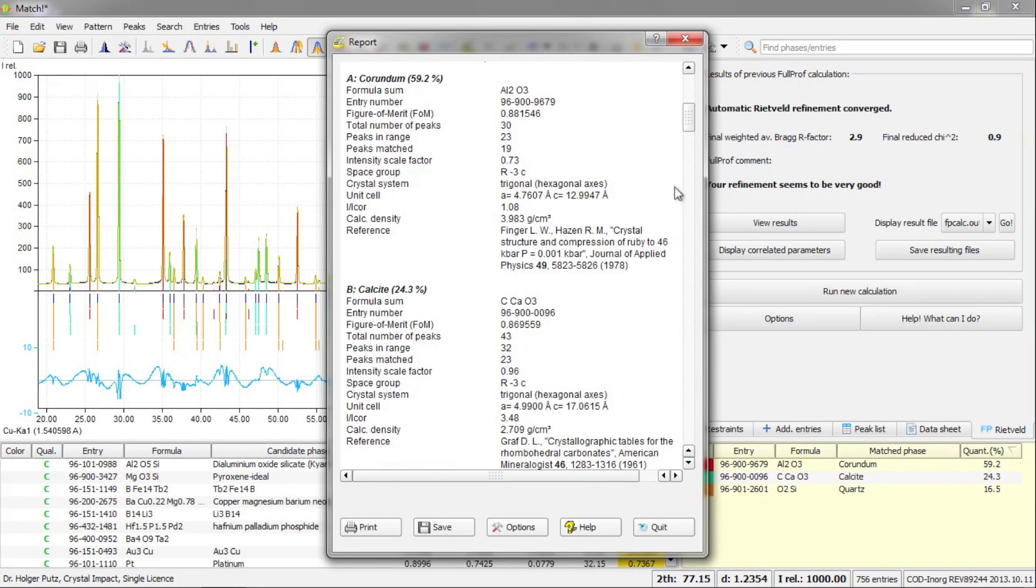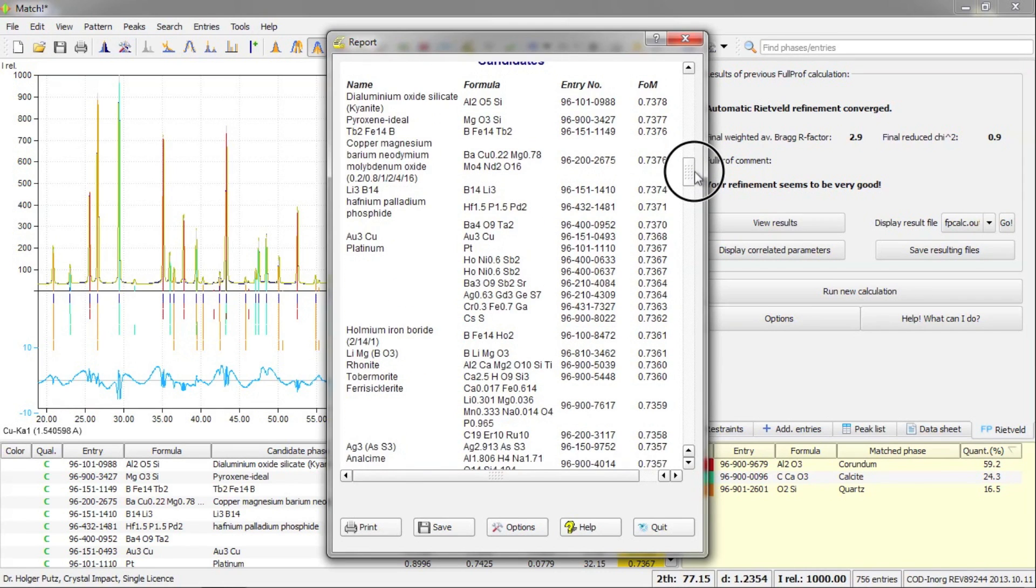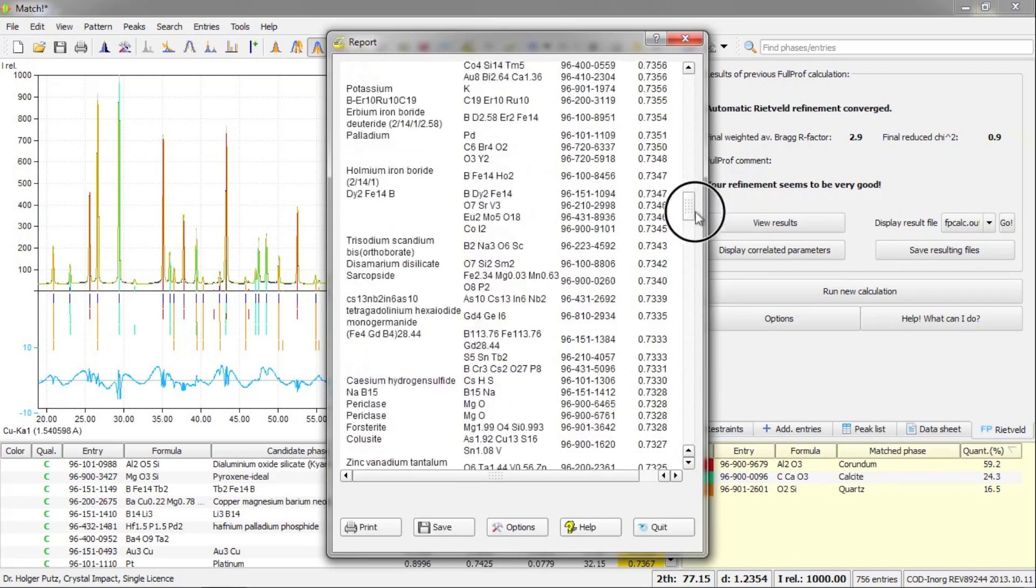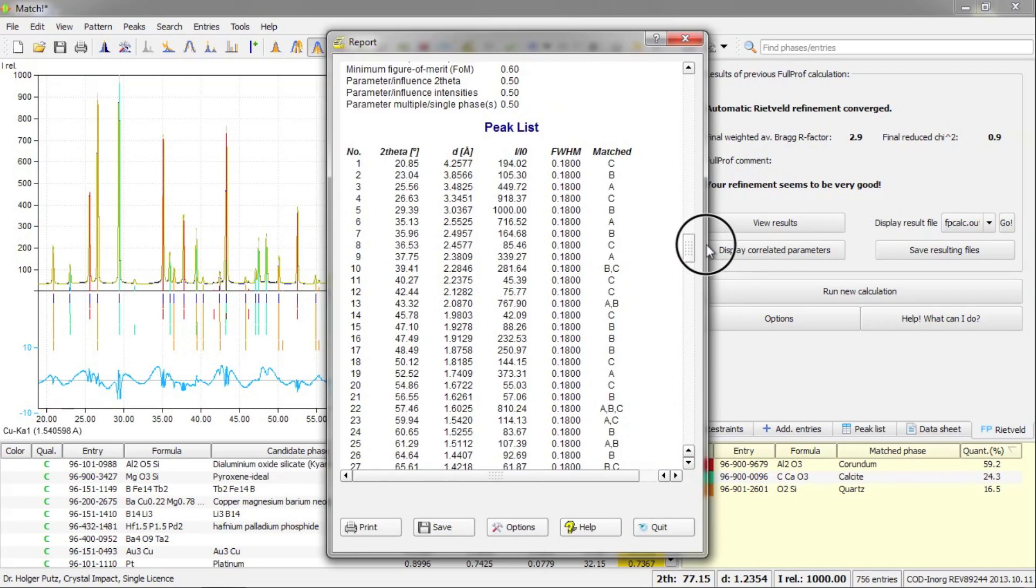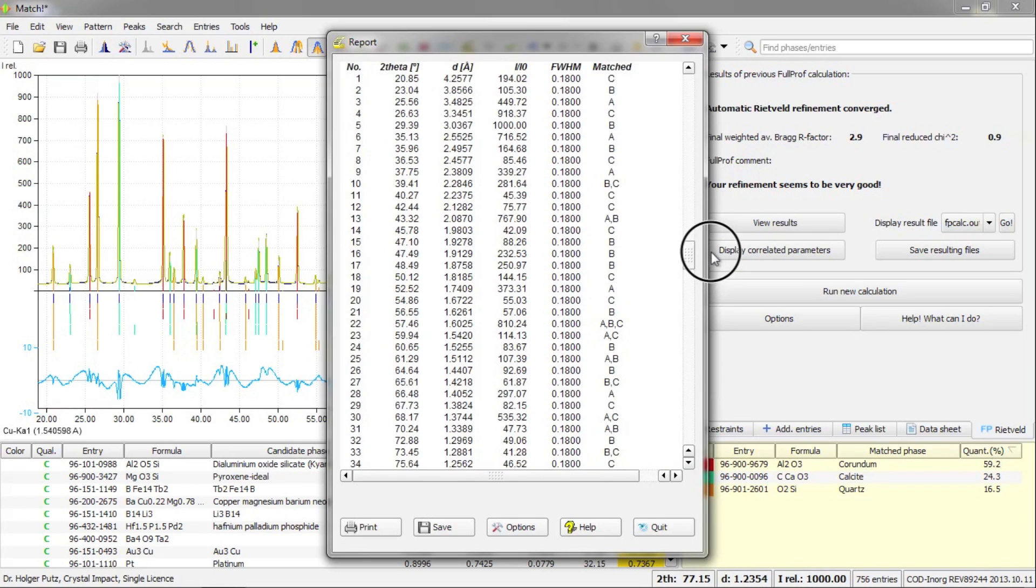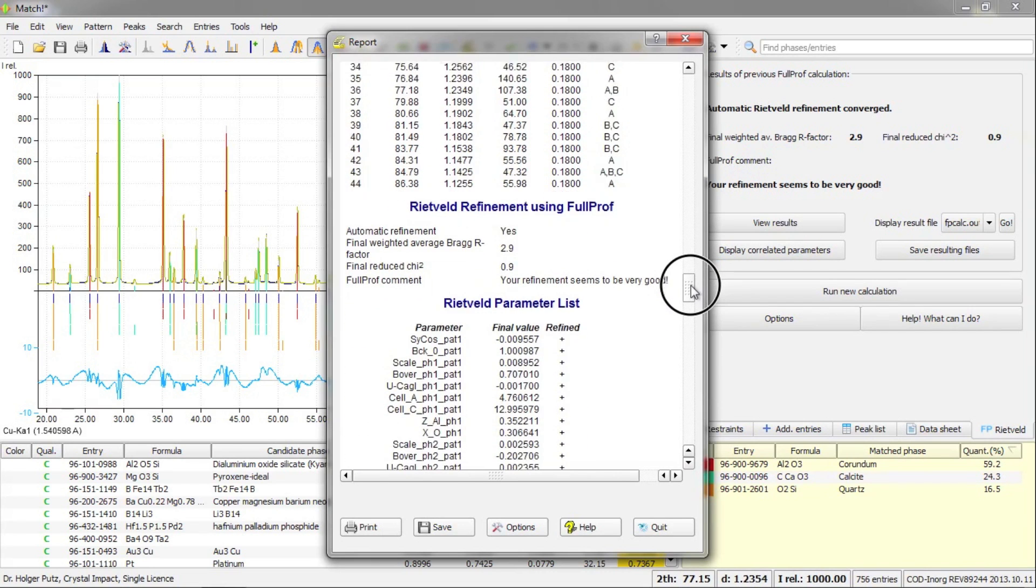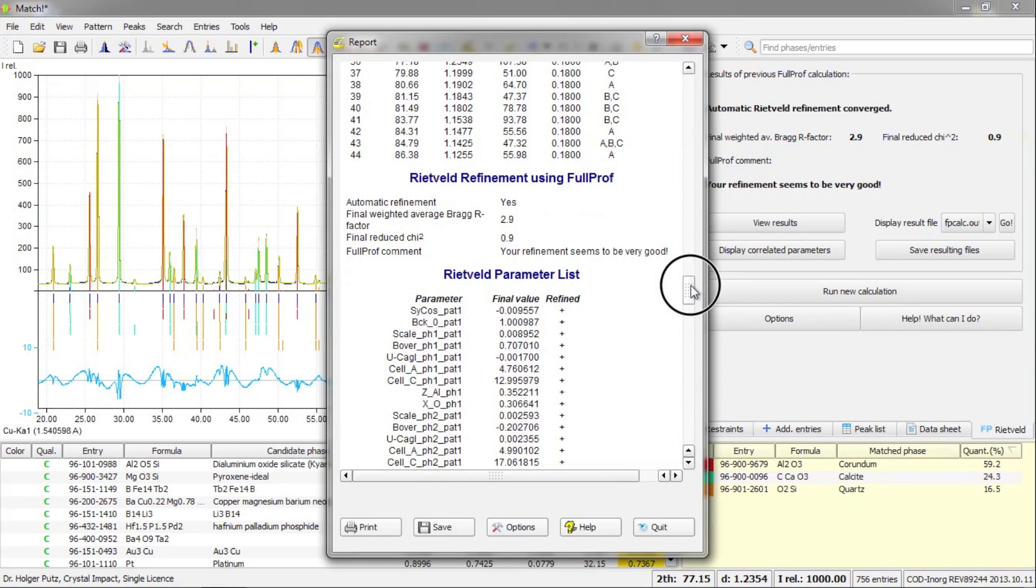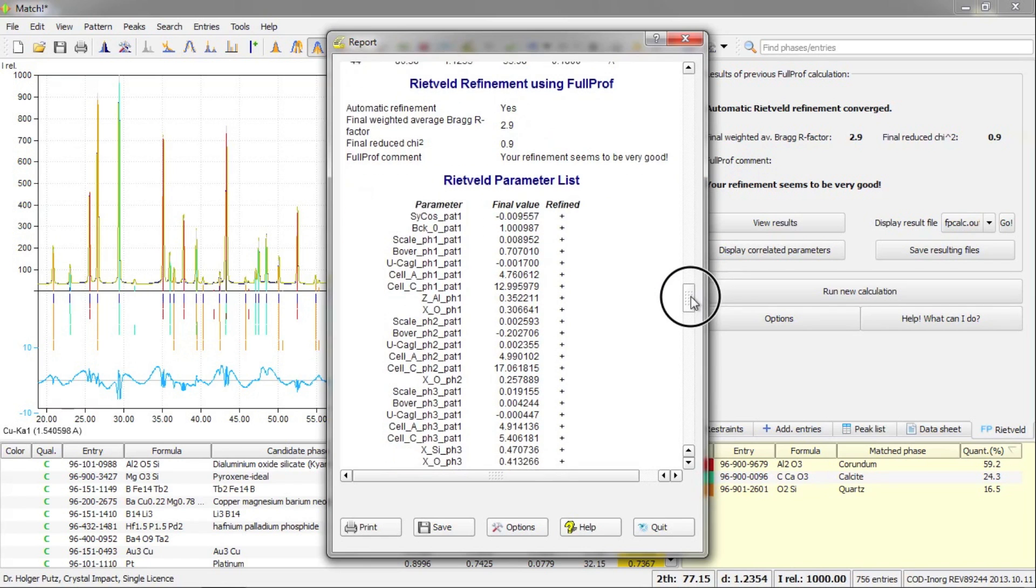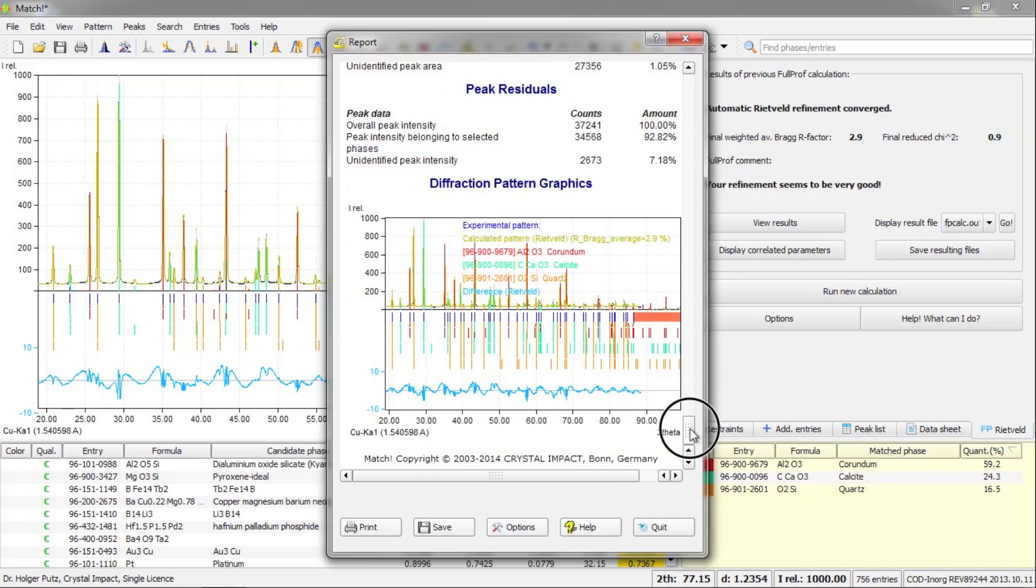The phases that you have selected as matching along with the corresponding amounts. Then we have some more details about these phases, like the crystal structure data and the reference. Afterwards, we have a list of candidates that are still left, and the peak list that also contains a hint which phases correspond to which peak. We have the results from the Rietveld refinement, the integrated profile areas, the residuals, and finally the diffraction pattern graphics.